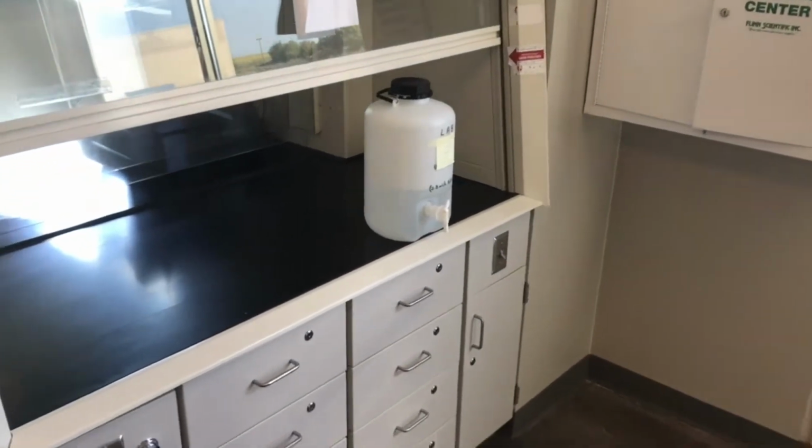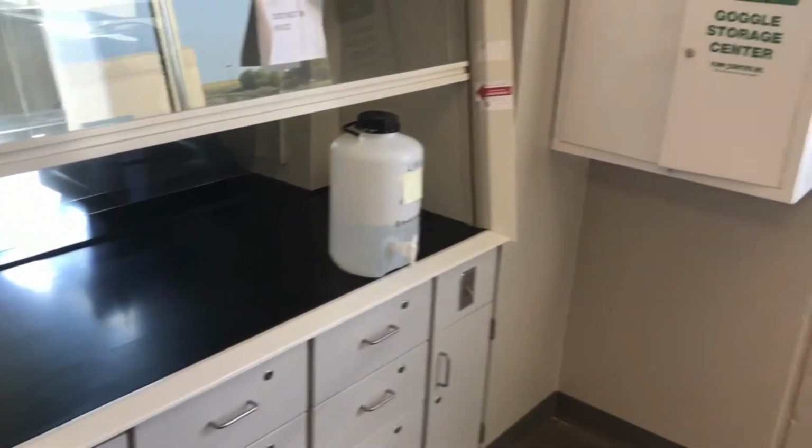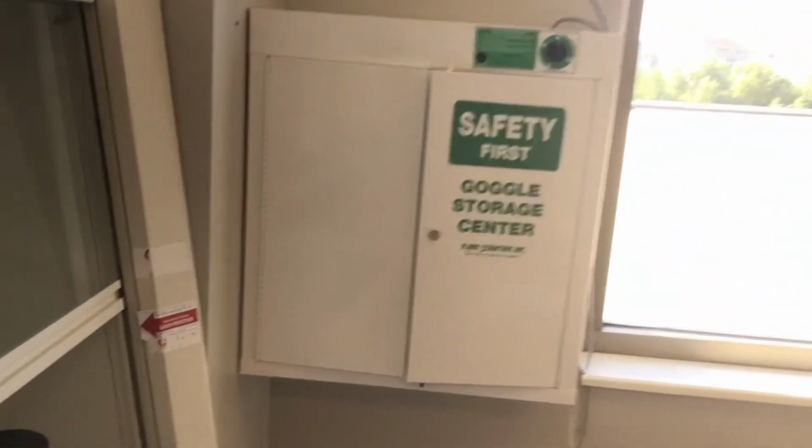Before we grab our acid over here in the fume hood, we need to make sure that we're all wearing goggles. So everyone in your group needs to wear goggles. Even if you're not the one handling the acid, I want every single person to be wearing goggles. So you can find these in the back storage case over here. Everyone needs to wear goggles. Mr. Wells is already wearing his goggles.